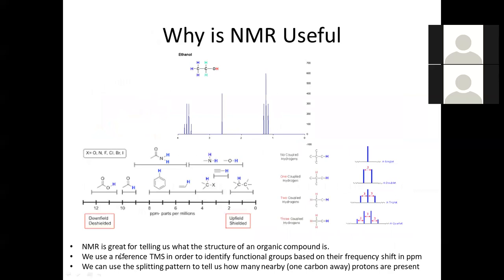Okay, so why does any of this matter at all? Well, I kind of alluded to it at the beginning, or maybe even straight up said it. It's great for telling us what the structure of organic compounds is, right? It's a great qualitative measurement for figuring out, okay, I have a molecule I made. What is it? What is its structure, right? That's what I want to know.